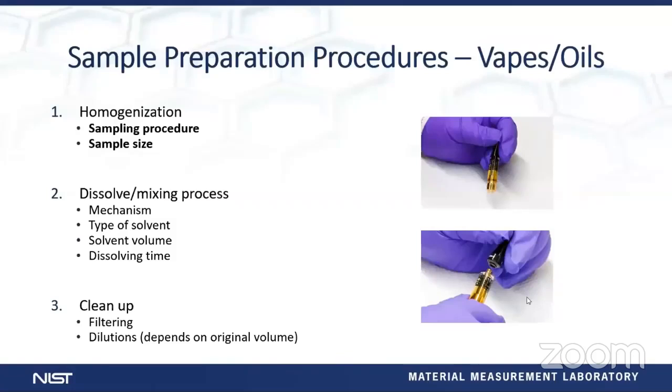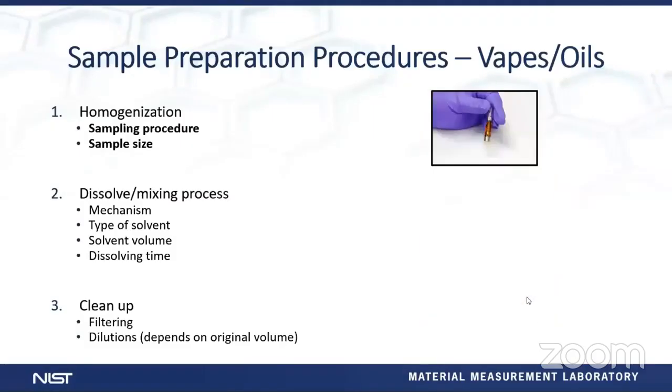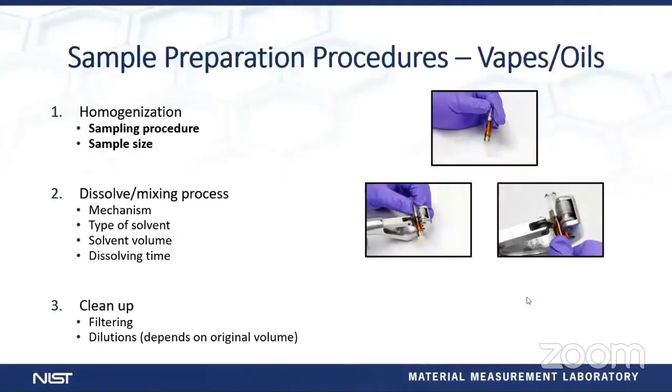But generally, the biggest thing we did run into is how to get the sample out of the container. Some of them were very simple, like what's shown here, where you just screw off the top and you easily could access the material. But there were also cases where they were fused together, where it was not so simple. So what we ended up doing was buying a pipe cutter at a hardware store for like 20 bucks, and we started to use that to basically cut the glass.